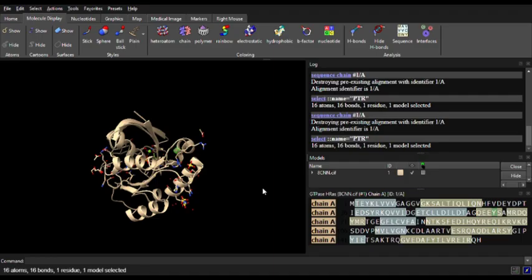If we click on it, it will highlight as green here. So here we have it as green and white. When you click on this, it will show you the number. So this is PTR 64. That's the position where the post-translational modification occurred. So we'll now head back to AlphaFold to modify this in the protein sequence.